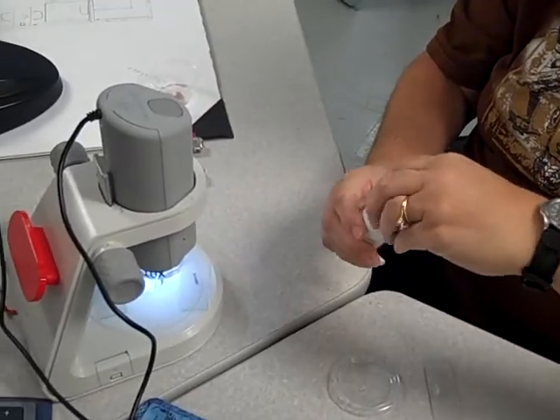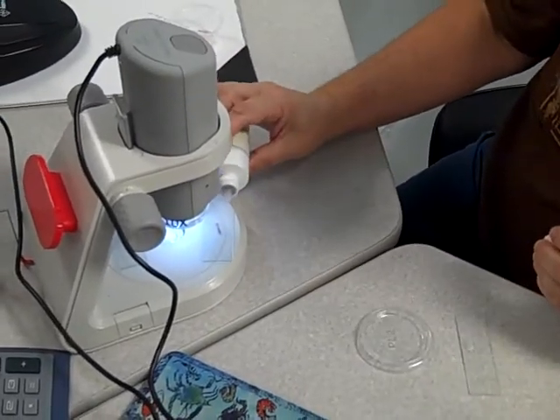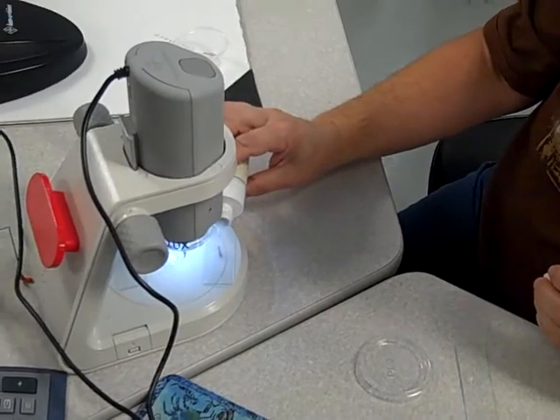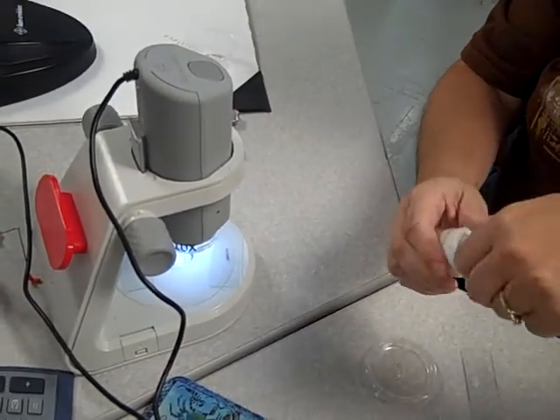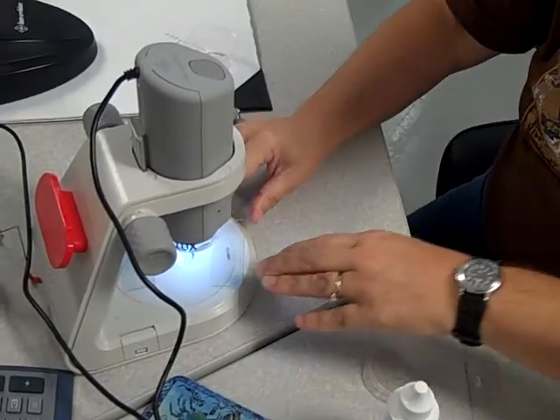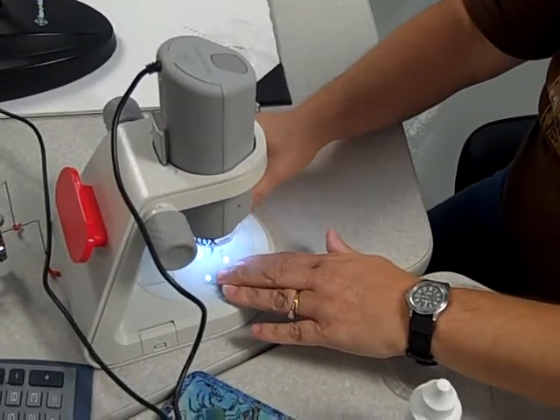Silver nitrate — just one drop right on top there. All right, and we're going to slide that part that has the drop on it directly under the scope.